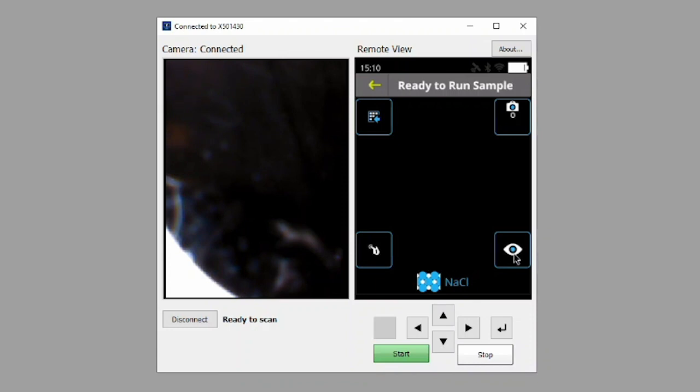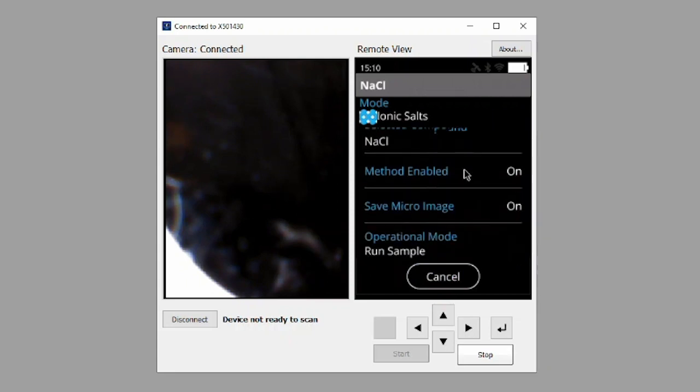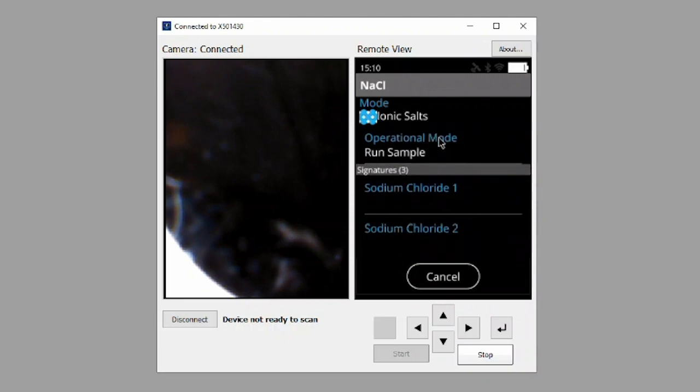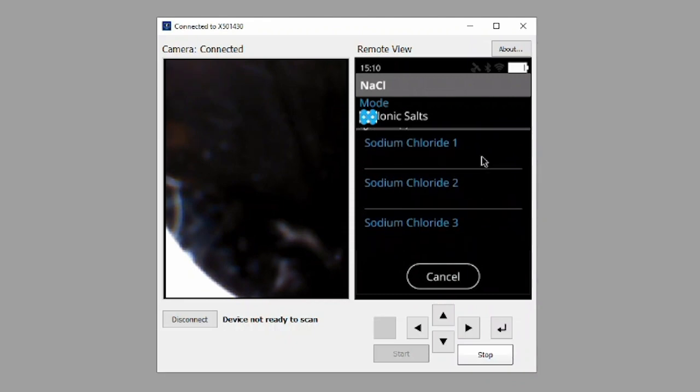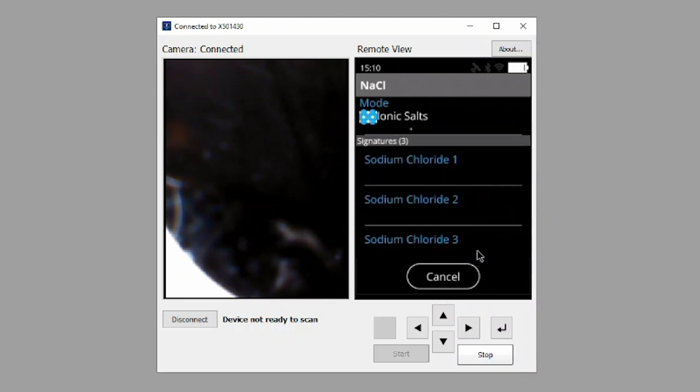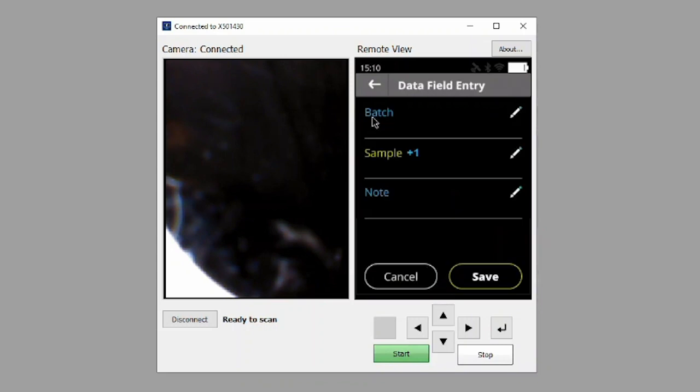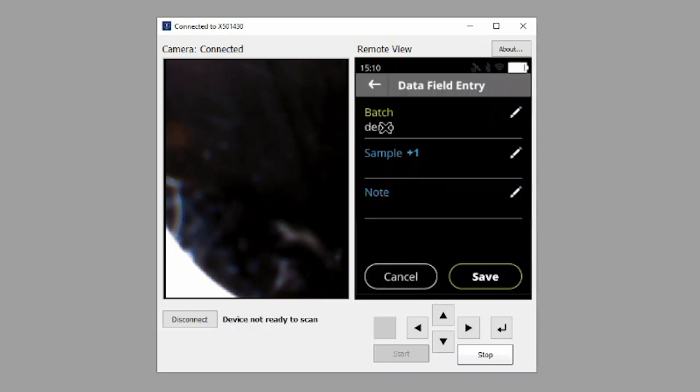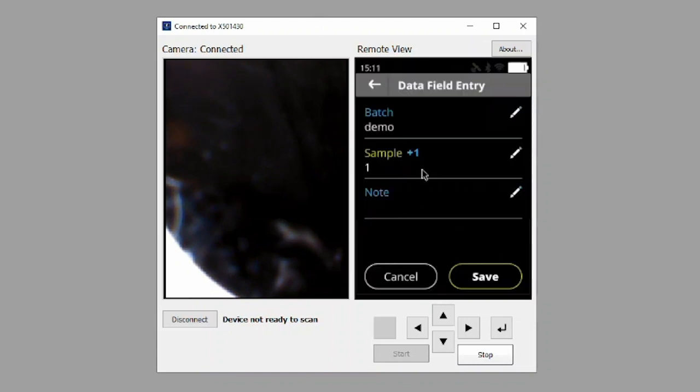Click the icon on the bottom right of the remote view screen to see additional details about the method that was selected, such as the method's name, the compound it is calibrated to identify, as well as the signature names included in the method. Click Cancel to return to the testing screen. Click the icon in the upper left corner to enter in your own batch, sample, and notes that you feel are relevant to your analysis. Once completed, click the Save button to return back to the testing screen.